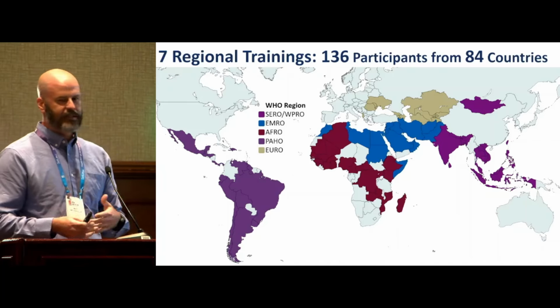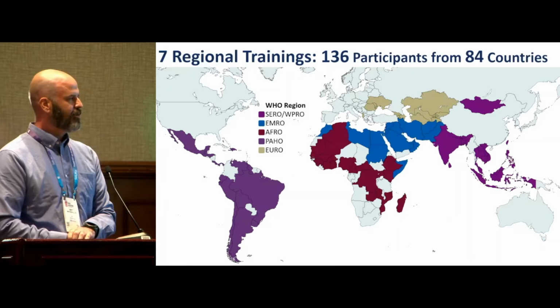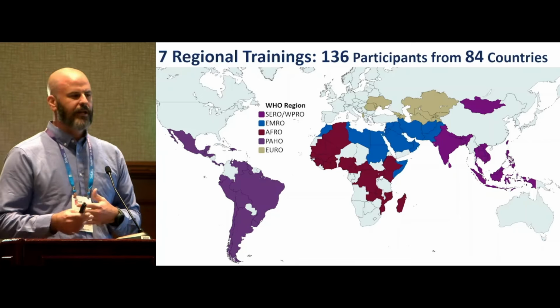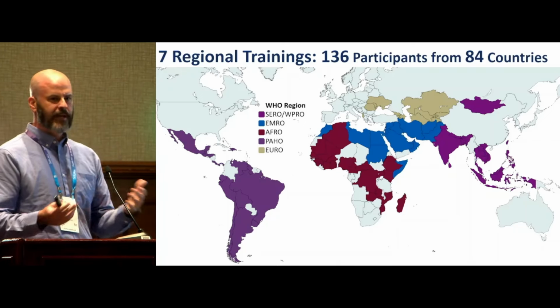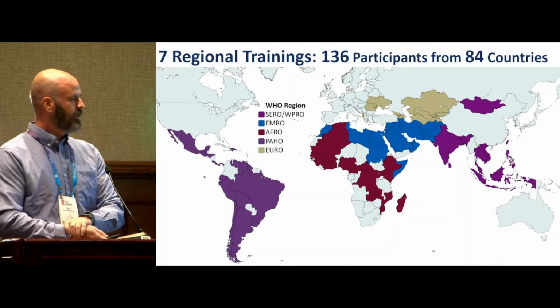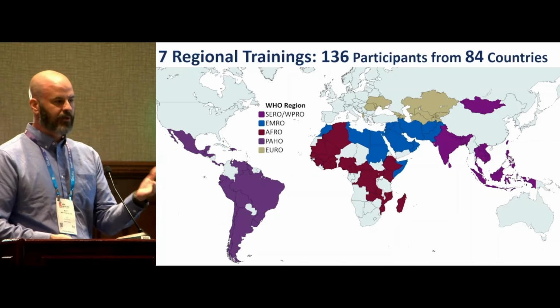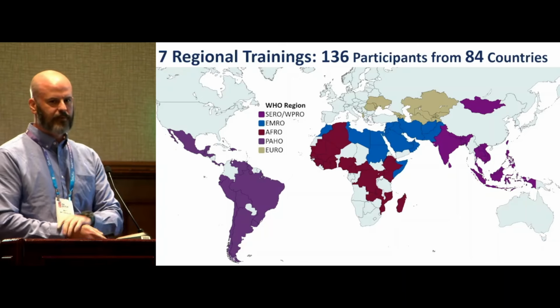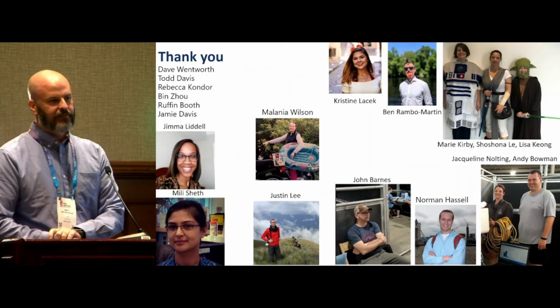Since COVID, there's an entirely new division at CDC, and they are using our training experience to build their own training program and how to teach countries to do surveillance and expand this to even more pathogens beside just flu and SARS. So this is ongoing work. We're going to keep doing hands-on training, and we are going to train the trainers on how to put together a program like this. This was a huge project, a very long-term one.